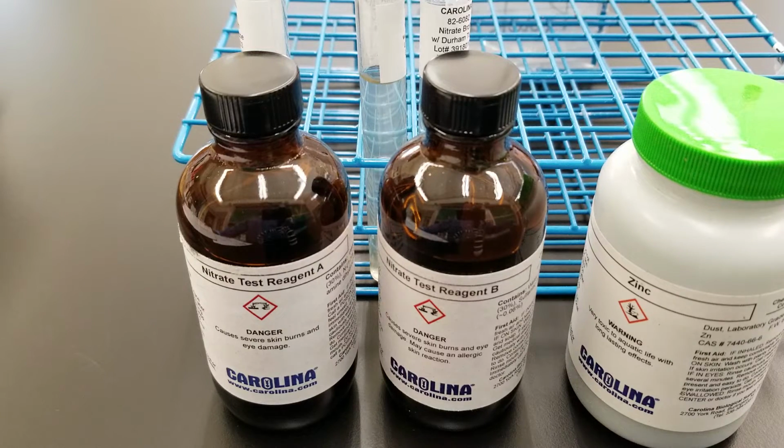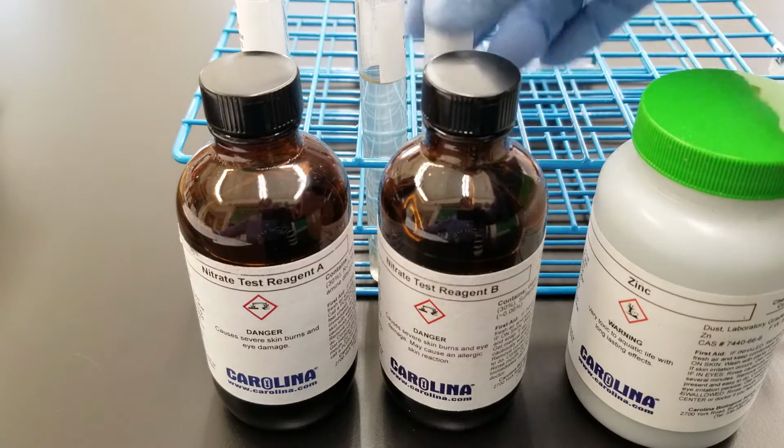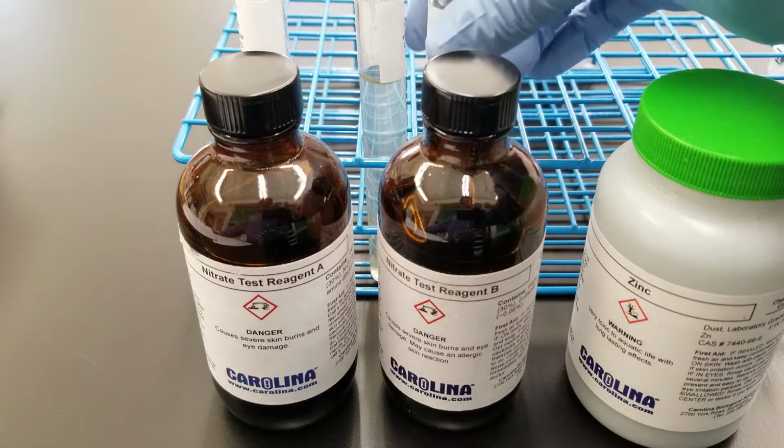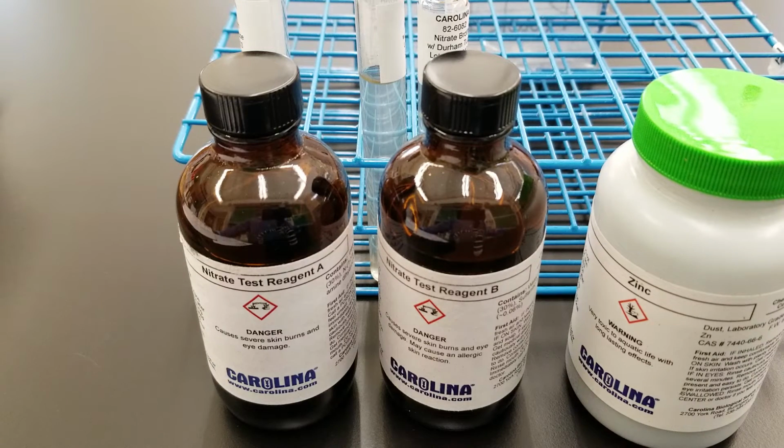Okay, so that could be why it's still the same color and didn't turn pink. If it turned pink, that meant that nitrite was present, okay, and the nitrate was reduced to nitrite. If there was no pink present, then that means it either went past nitrite to those three compounds that I told you about, or it still has nitrate there and it's a negative, okay?